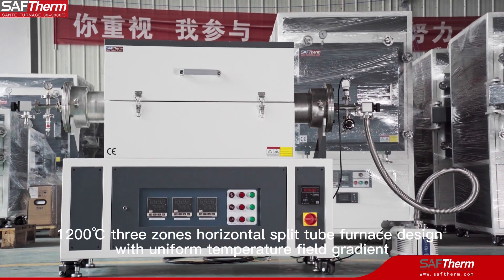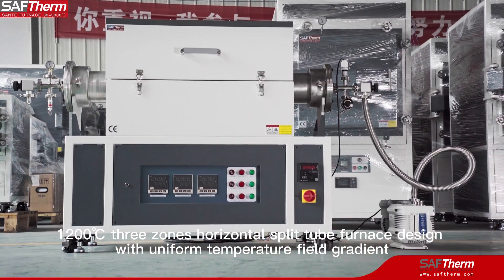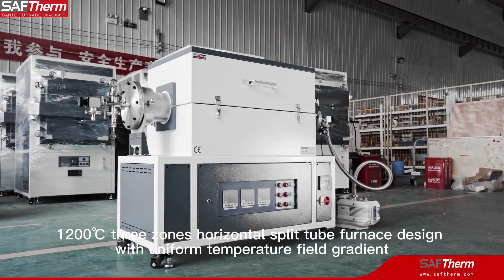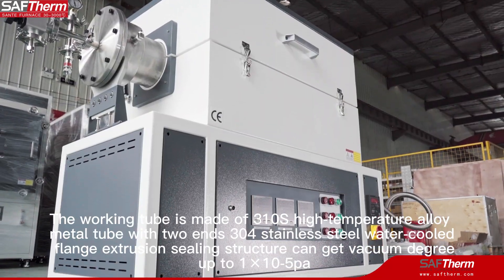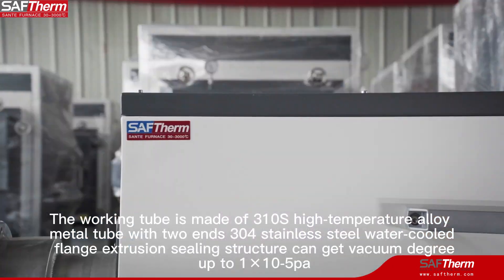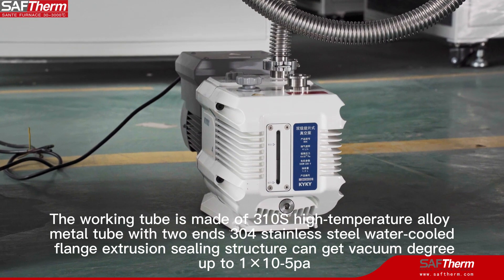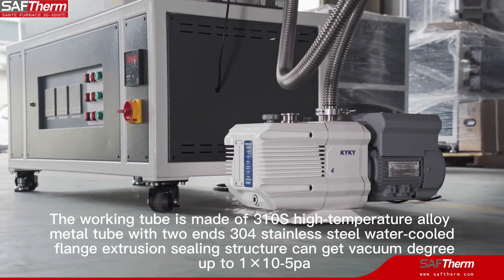1,200 degrees Celsius, 3-zone horizontal split tube furnace design with uniform temperature field gradient. The working tube is made of 310S high-temperature alloy metal tube, with two ends featuring 304 stainless steel water-cooled fringe extrusion.